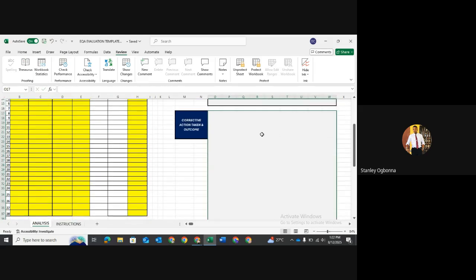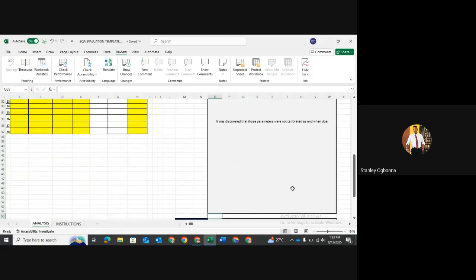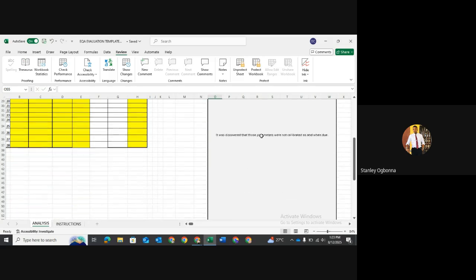And then for my corrective action, I write what I did. Let's say it was discovered that those parameters were not calibrated as and when due. So calibration was done and then it passed. So you've automatically entered what your corrective action and your outcome was.